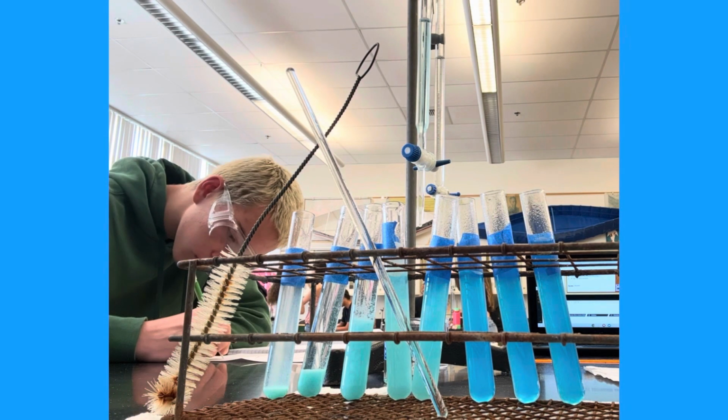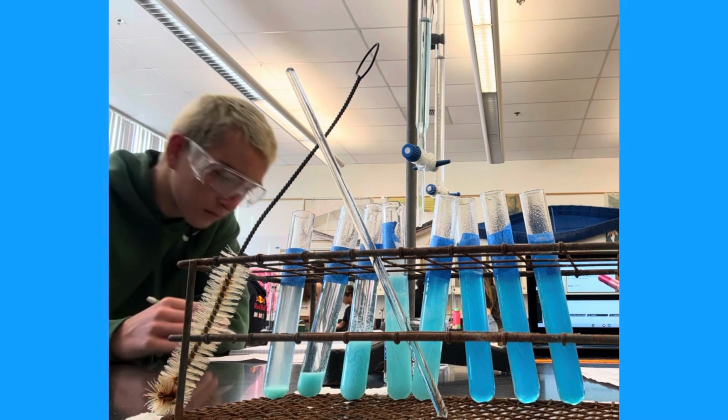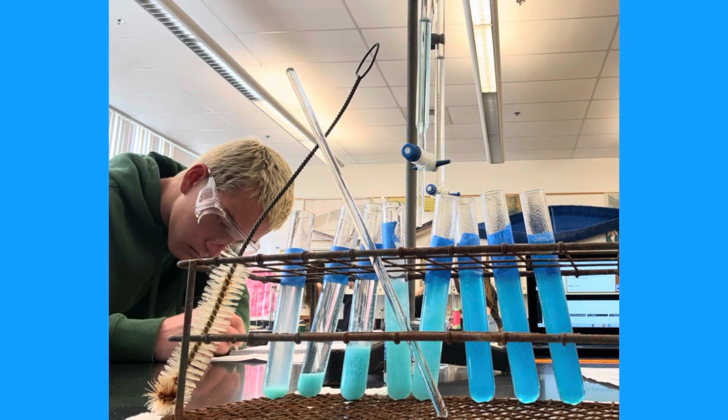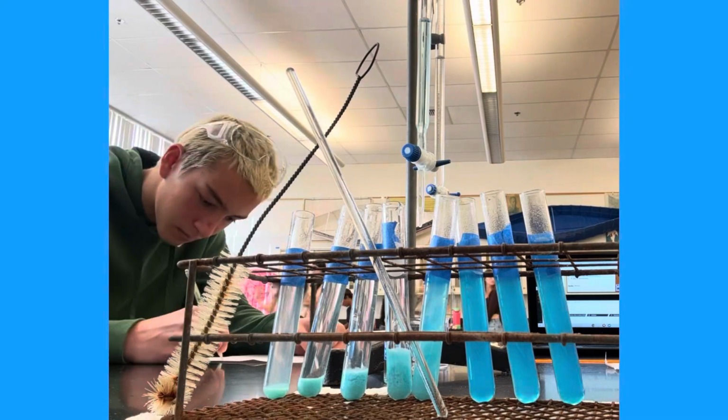We also added water to the mixture to ensure that each test tube had a total of 13 milliliters of solution. We then used a stirring rod to completely incorporate the solution into each test tube. Placing them in the rack and allowing the products to settle for about 15 minutes, we used 2 beakers on either burette to catch any reactant that may have escaped out of it.